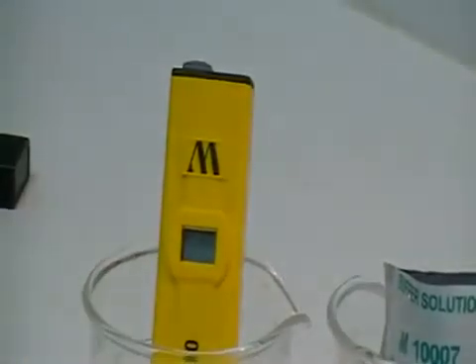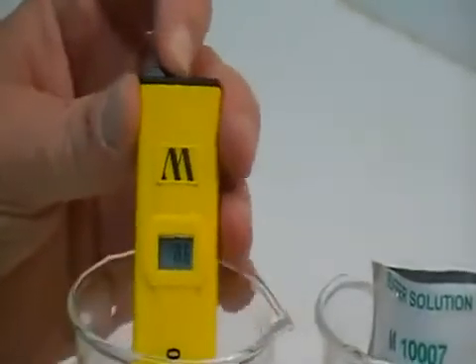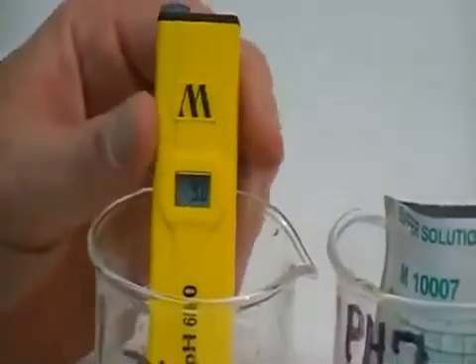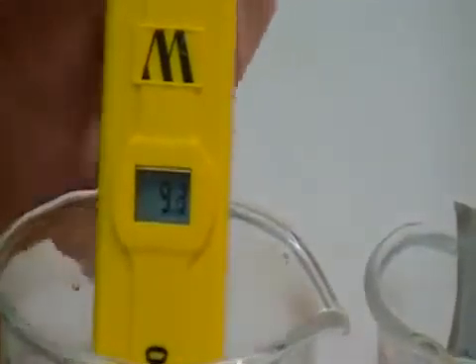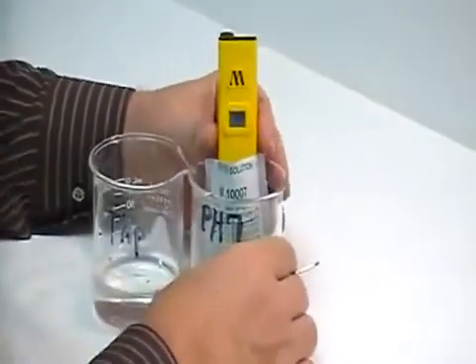When you get ready to do your calibration, the way you would proceed is to turn the unit on. As you see, it has a display that has no bearing on anything until it is calibrated. Take a little paper towel, wipe off the excess water, and go into your pH 7 calibration solution.